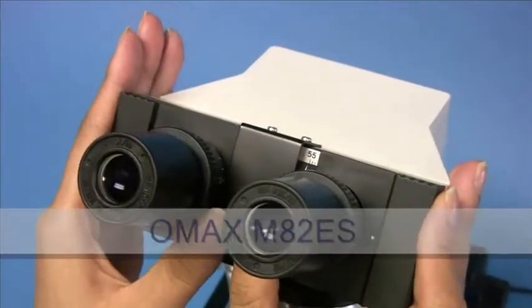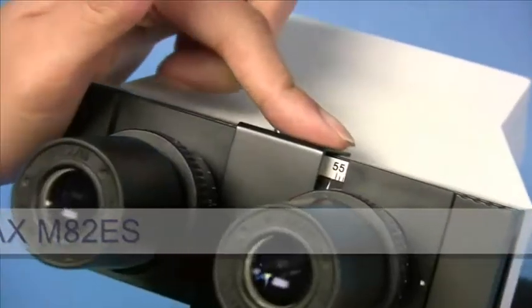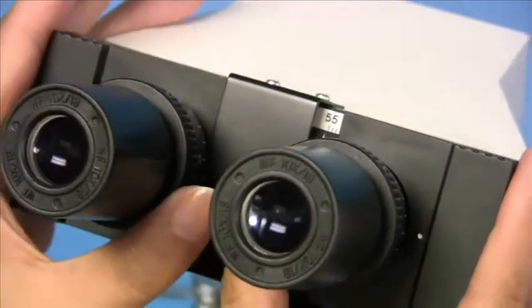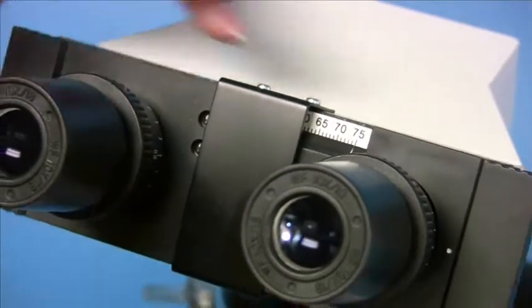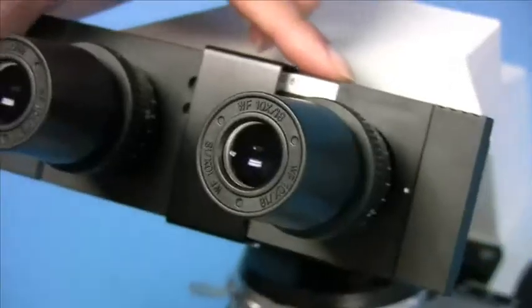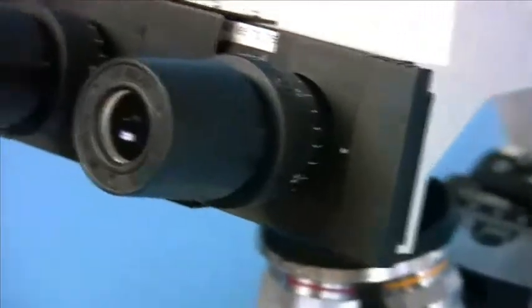The distance can be adjusted from 55 mm all the way up to 75 mm, depending on each user's interpupillary distance.